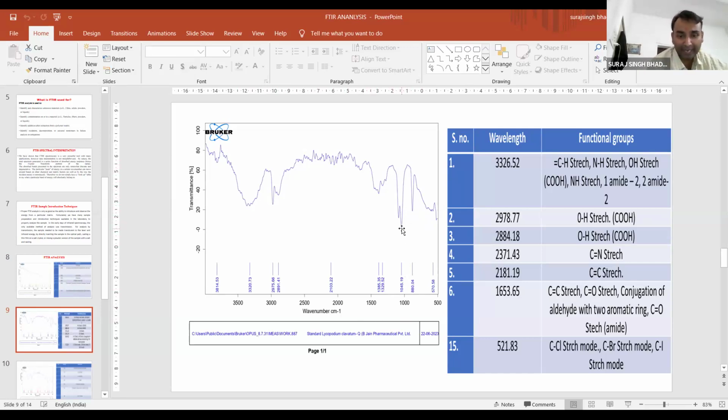So this highest peak is generally because of the aldehyde group, the aromatic ring, conjugated compounds, unconjugated compounds, generally the conjugation. What does it mean, conjugation? Conjugate means the junction and the joining of two different molecular compounds, and then it forms a new molecular system.